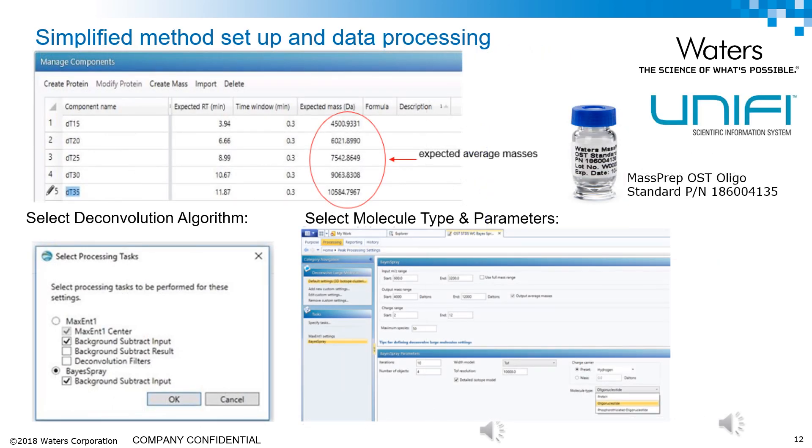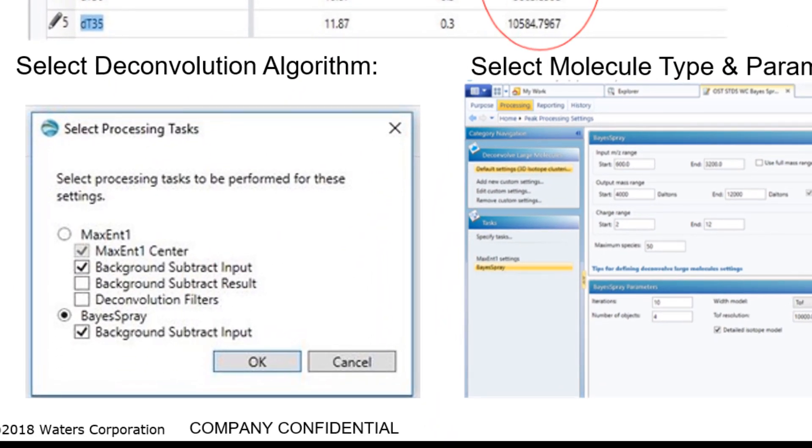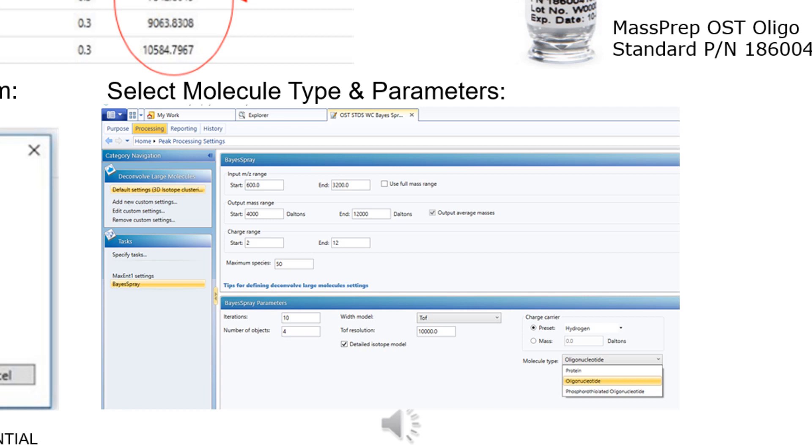In the method setup for the mass spectrometer, we define the expected molecular weight of the primers that we're manufacturing, and we work this out from the intended sequence for the primers. In this case we've just put in the molecular weight of the sequences that we know are in the standards. Then we can control and set up the processing parameters, including the parameters for deconvolution. And even amongst the few settings that there are, we can tell the instrument that we're looking at oligonucleotides so that it can automatically optimize the processing for them.